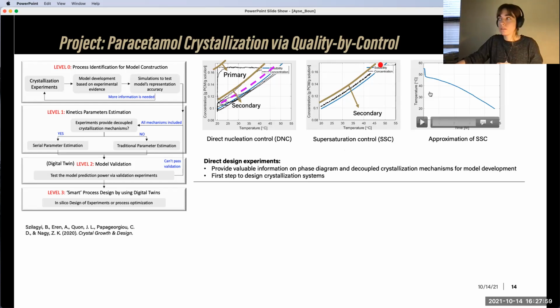And I'm going to show you the crystals as well. And the third experiment is just to give some initiative to industry. So this is the temperature profile. This parabolic cooling curve is the temperature profile obtained from this experiment. And then actually you can approximate this temperature profile by fitting 3 lines, because in industry, most of the time, they don't have these fancy tools, and they can just do this linear cooling. So that's what we do for them and say, hey, okay, if you do this experiment, you will grow your crystals without nucleating, basically the reproduction of this experiment.